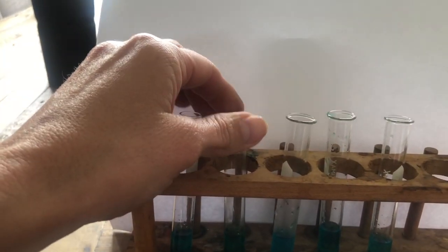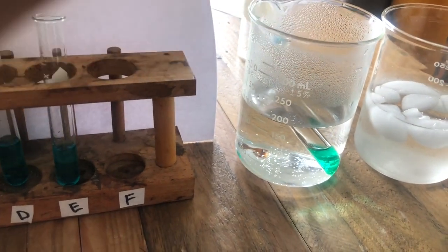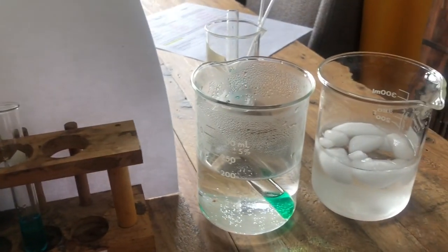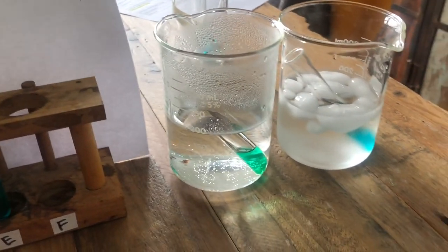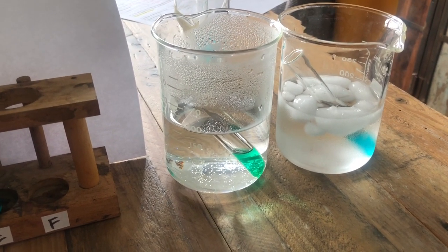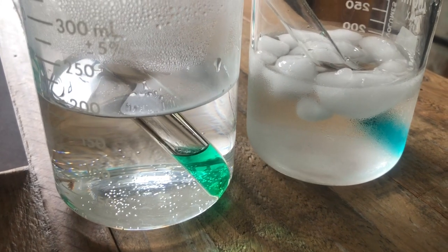For the second test tube, it tells us to increase the temperature. So I have a hot water bath that I am going to add that test tube to. And then I also have a cold water bath for test tube 3 that I'm going to add test tube 3 to. Now over time you can see the color change there. For test tube 2, the color of the test tube is really turning a very pretty green color.